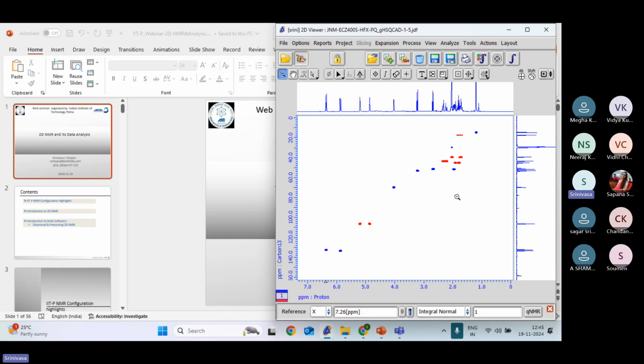So now I have given the representation experiment for you. So that is COSY and HSQC. Now COSY is a magnitude mode. COSY, HMQC, HMBC, all three experiment processing is a similar way. But HMQC and HSQC, you have to load the heteronuclear correlation spectra. But HSQC, NOESY, ROESY, TOCSY, these are the phase sensitive experiment. These experiment, you require a phase correction. So you need to do that. So anyway, phase correction method I have shown in the HSQC, you can follow that.